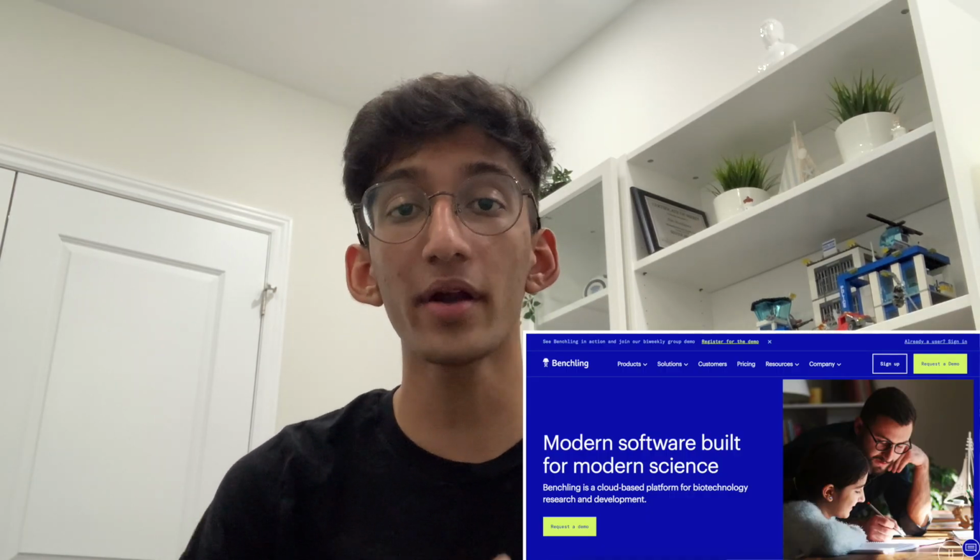So this is all well and good, but what can we actually do to stop this? I mean, I'm just a 16-year-old without access to a lab and millions of dollars worth of research funding. So I had almost given up until I found Benchling, which is a modeling software that allows us to create solutions all from the comfort of our home. With Benchling, we can create a workaround that enables us to beat breast cancer once and for all.